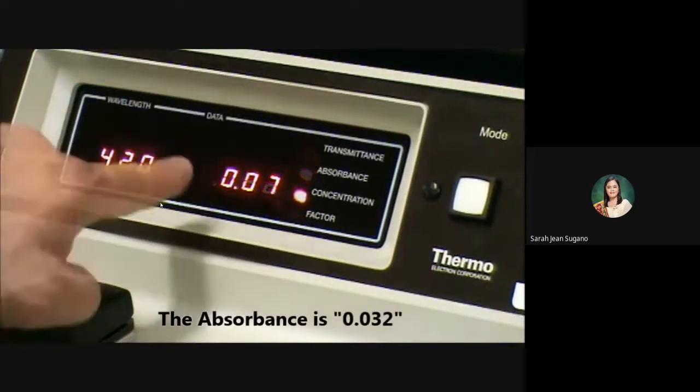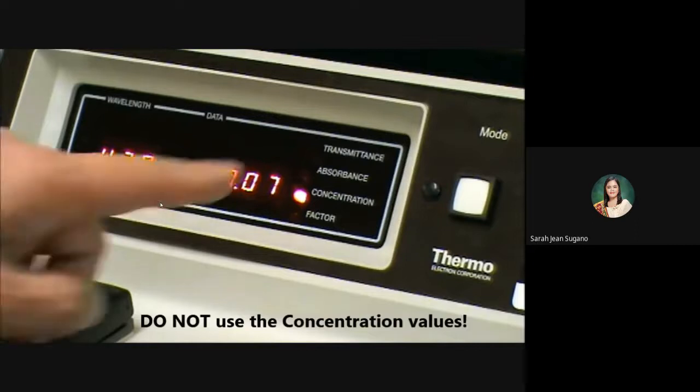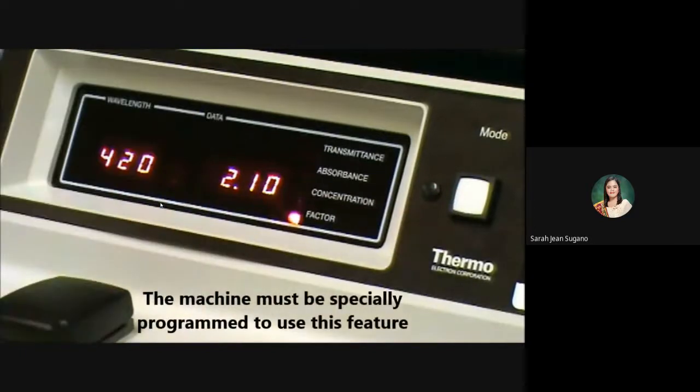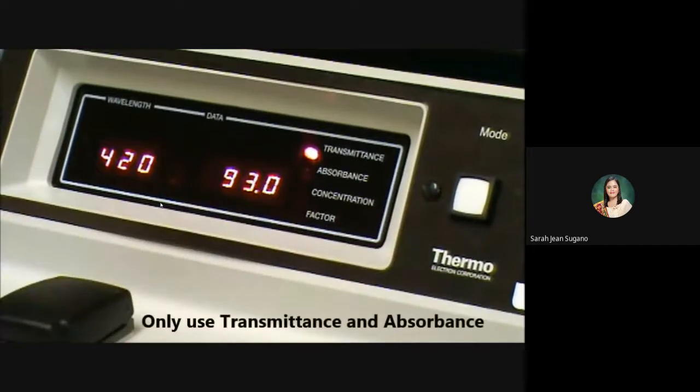You want to ignore that. The machine has to be set up specifically in order to use that option, and this one is not. So do not write this concentration down, and you need to know the correct factor in order to set the concentration. So ignore those. Just use the transmittance and absorbance on the machine.